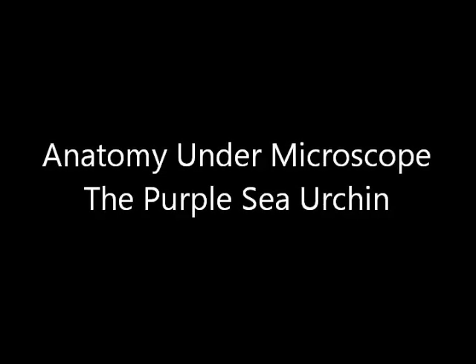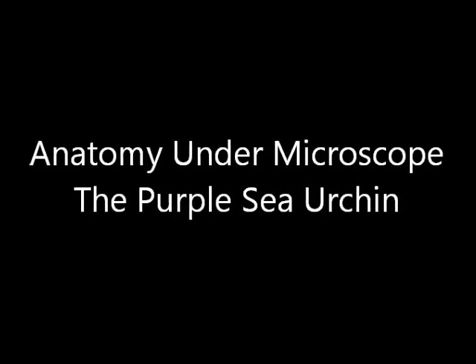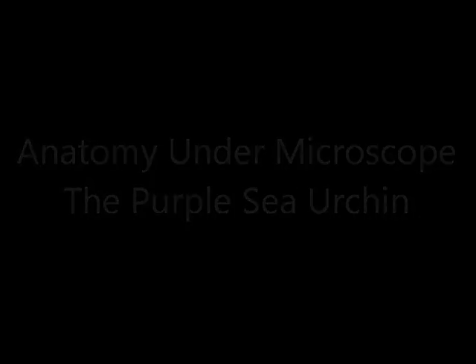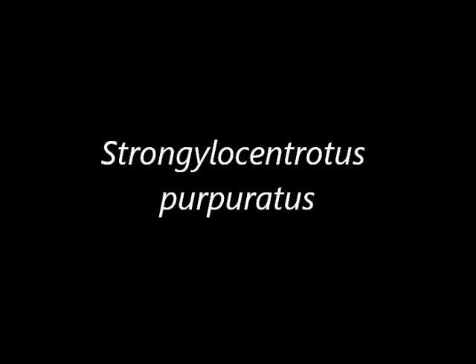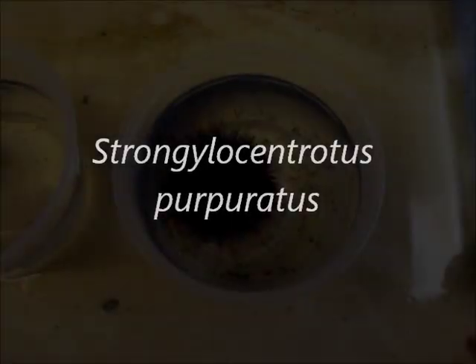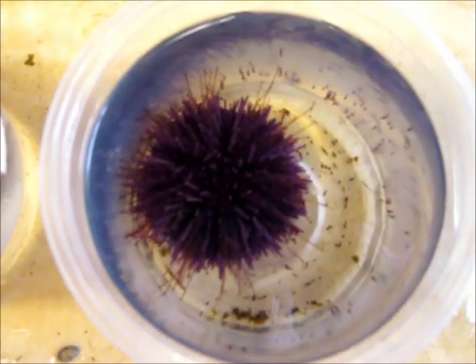Something I've always thought was interesting was the anatomy, the external anatomy of the purple sea urchin under microscope. Although the internal is pretty cool too. Strongylocentrotus purpuratus is the species name, and I've got two individuals here that we can look at. Here's one and here's the other, so let's take a look.